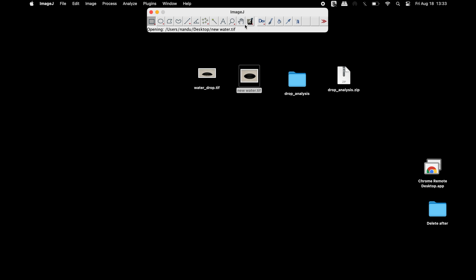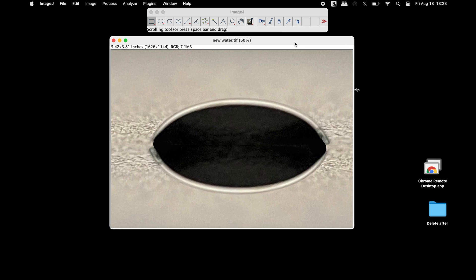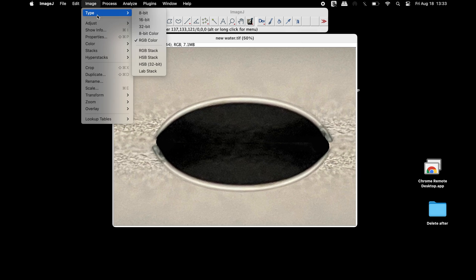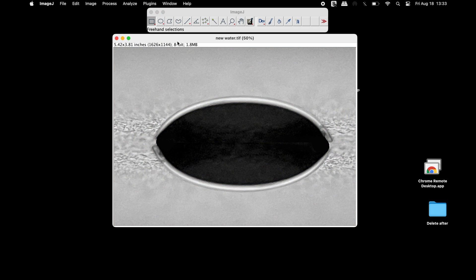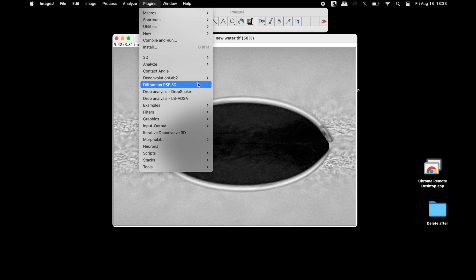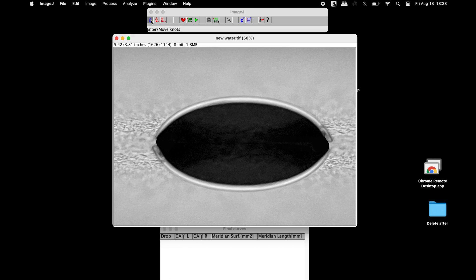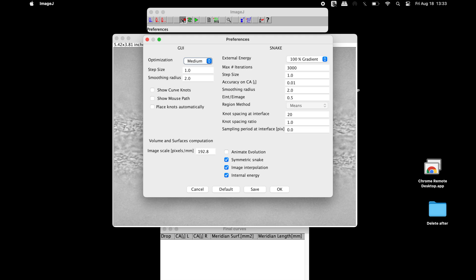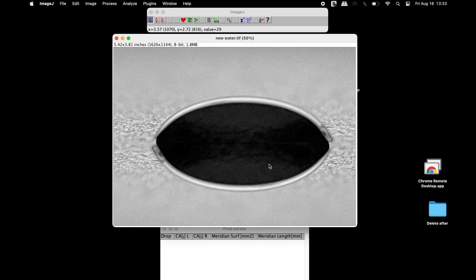To use the Drop Snake method of analysis, open the image of interest using ImageJ and convert it into an 8-bit image. Click on Plugins and select Drop Snake. The ImageJ toolbar is replaced with the Drop Snake toolbar. Click on the settings icon and select the parameters according to the image type, then click OK. Now click on Enter/Move Knots and place around 10 knots, beginning at the left interface point and continuing to the right interface point.